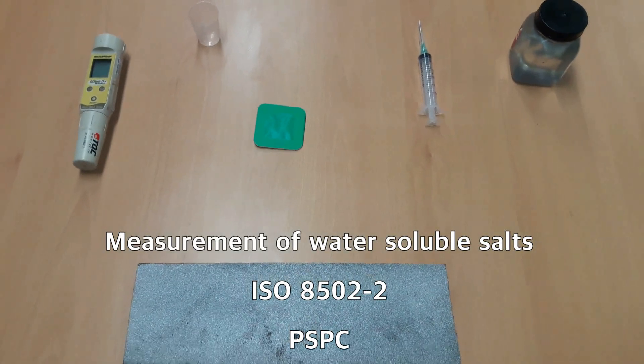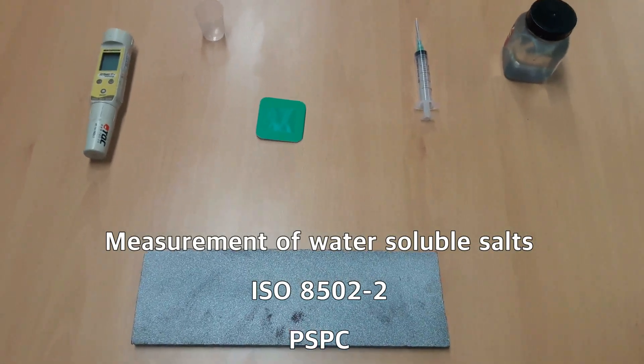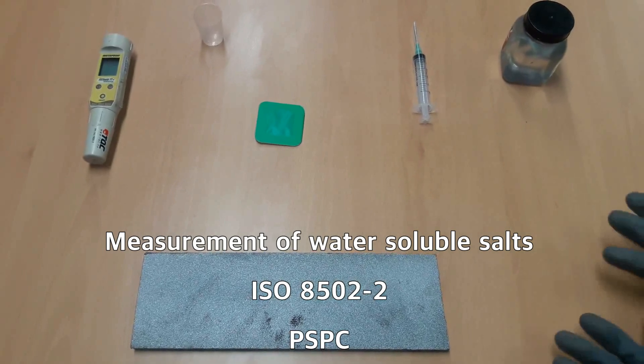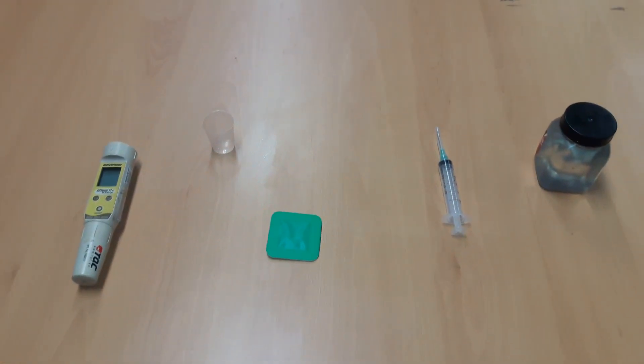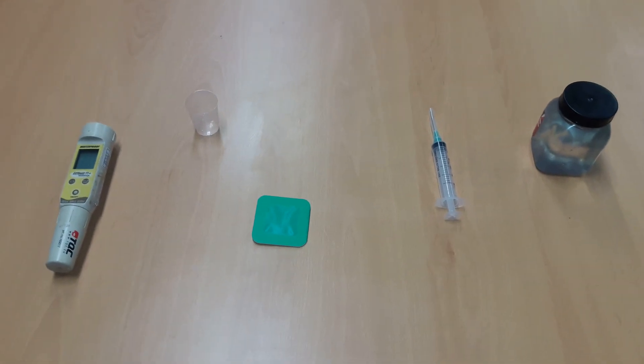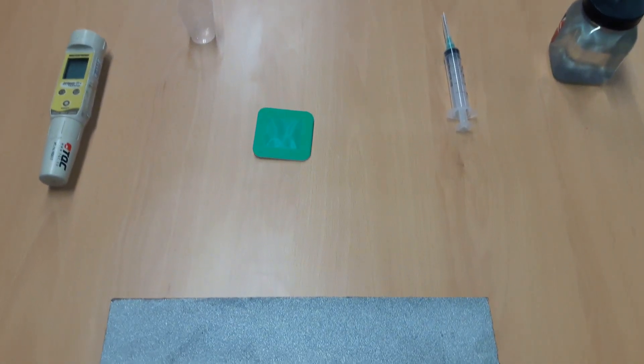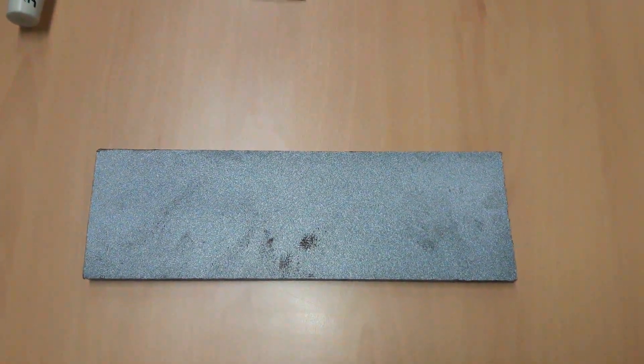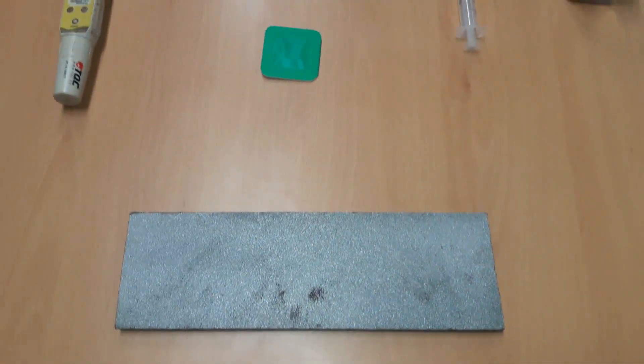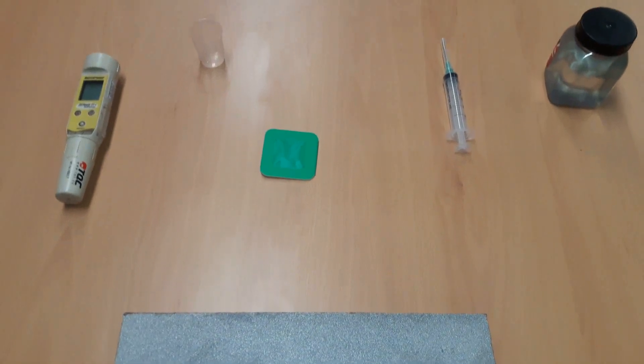Extraction of Soluble Salt Contaminants for Analysis, the Bresel Method. Objective: to be familiarized with extraction method of soluble contaminants, specifically salt, for analysis using a simple and inexpensive field method test for assessment of total amount of water-soluble salt using flexible cells in the form of adhesive patches designed to be filled with solvent, or the Bresel Method.